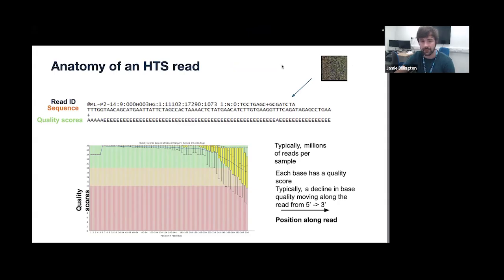The image of fluorescent labels that we took on the sequencing machine, we now deconvolute and turn into a DNA sequence. Based on the colors, we can infer what the base was, and for each position in that original flow cell, we can figure out what the original DNA sequence was.